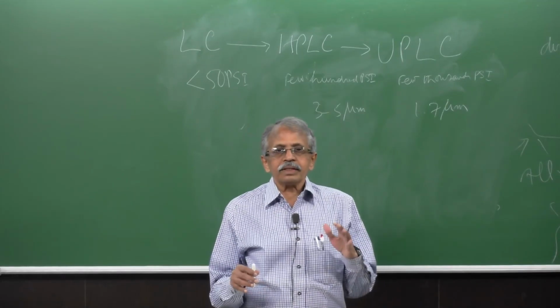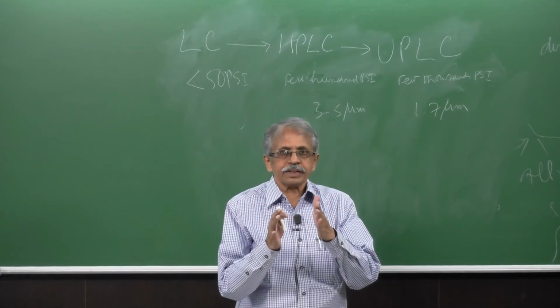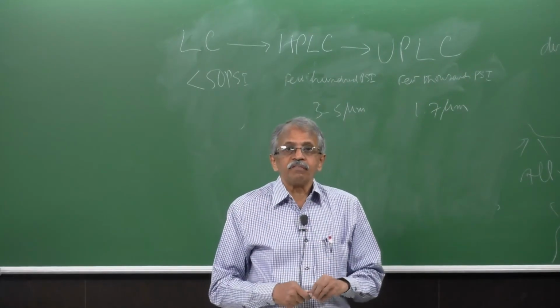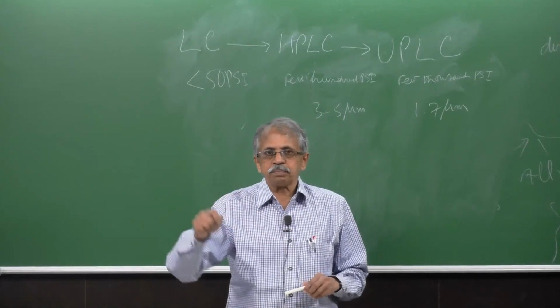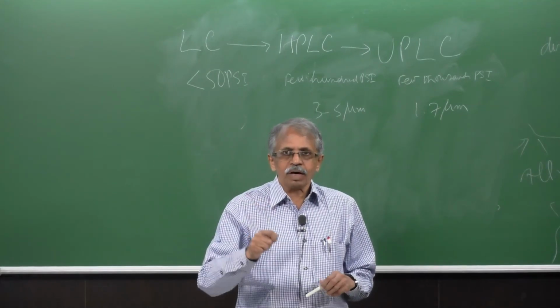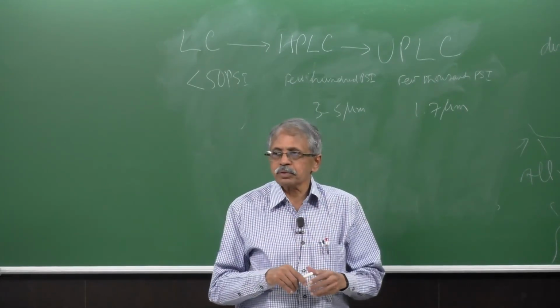I think in the previous class plus this class put together, I have given you an idea of separation techniques, purification techniques, in principle, in particular focused on chromatography, which can be used for routine chemistry type samples coming from research, food, forensic, environment, water, pollution, any kind of things, and on the other side biological proteins and other kinds of samples.